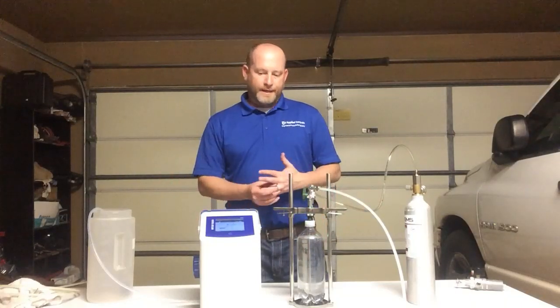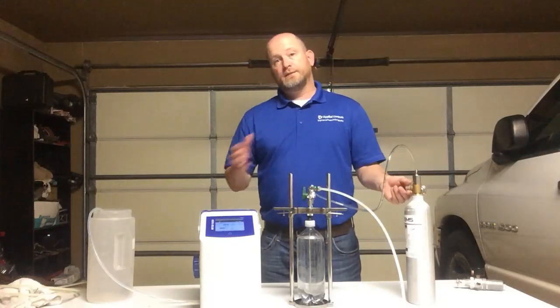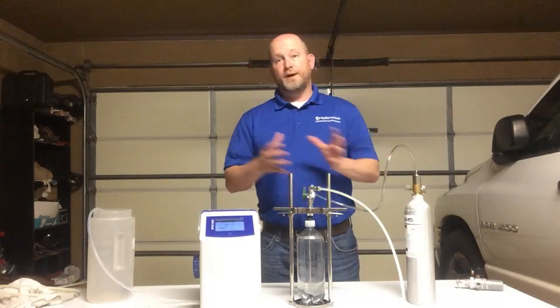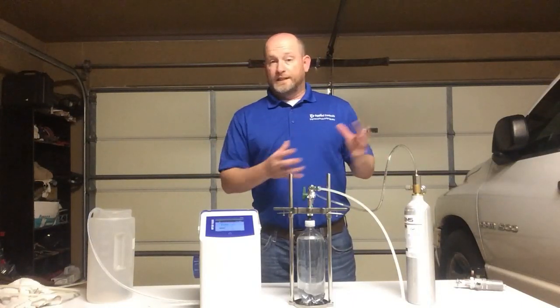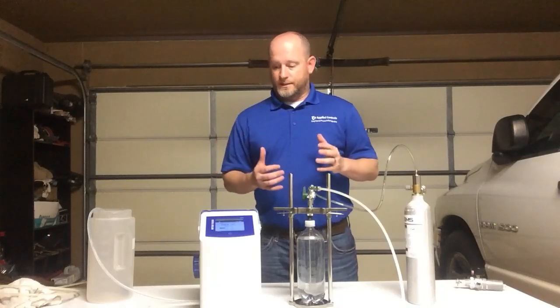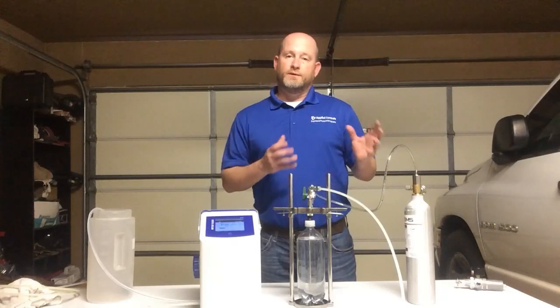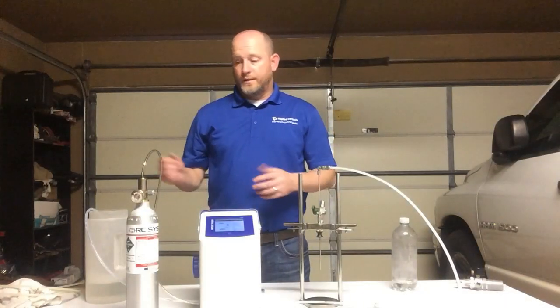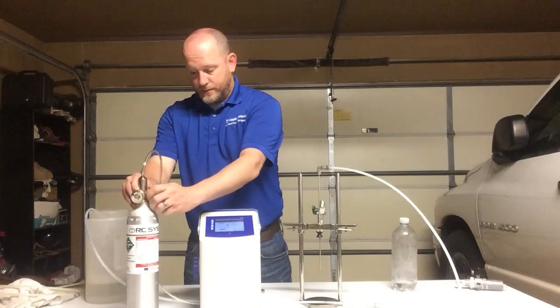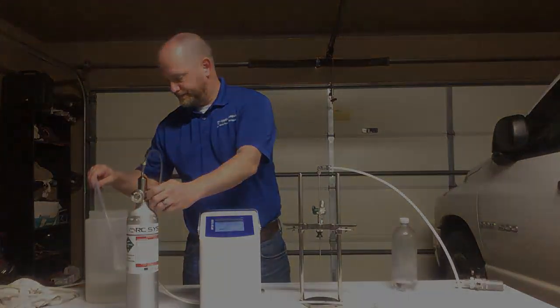It doesn't build up. And it's also important for you to do this when you go from tank to tank, from a beer batch to beer batch. You don't want to sit there and be mixing those. So definitely clean it between every single step of your process. Again, you do that, flushing it with warm water, and then once you're done with that, you take the nitrogen and blow it through to dry it out to get all the liquid out. So once I flush that out with water, now I want to flush it with a little bit of nitrogen. That way we make sure we get all the moisture out of there and it's ready for next time.